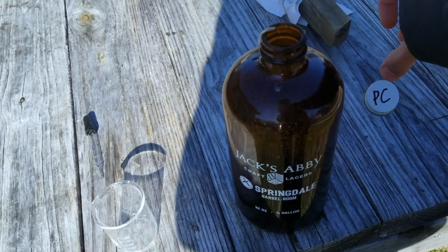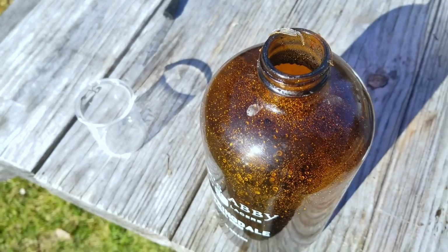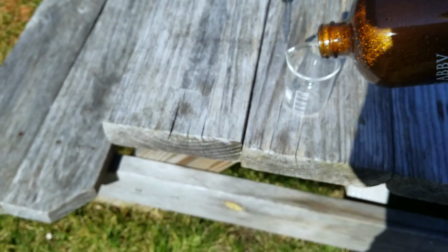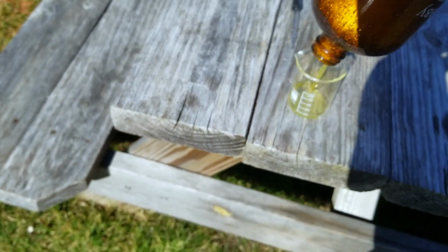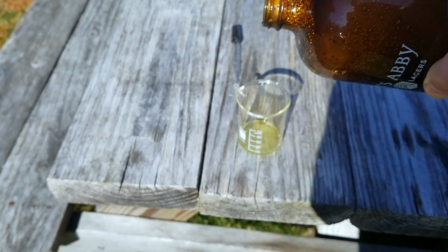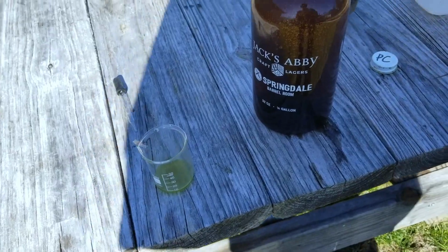So, oh god. Okay, so you may not be able to see this, but there's condensation on the inside. So maybe it's not fuming anymore. Regardless, I really don't like this acid. Oh god. I'm just gonna wipe my hands with this. And of course, if you're wondering why I'm not wearing gloves, it's because I'll catch the gloves on fire.